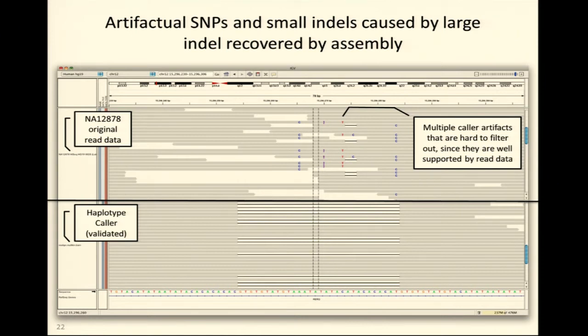And there are other cases that we see which are very common, in which, when you have these sort of large deletions, the mapper is going to place the bases at one edge of the deletion, and then it's not going to know what to do with the rest, and then it's going to soft clip the rest of the bases. So essentially, it's going to try to throw them away. I mean, luckily, they're not really thrown away. They're just marked as clipped, but we can recover them. So that's actually a very strong signal that there is an underlying true event there.